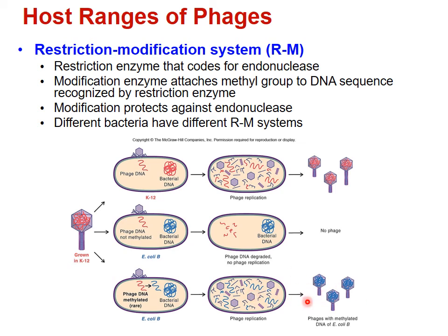So the sensitivity, at very low frequency, can switch. You can start out with phage from K12, but it will survive on B, and it'll end up having modifications identical to those you get from bacteriophage that infect the B strain. And then these B strain modified bacteriophage can easily infect E. coli B, but will now have a difficult time infecting E. coli K12.